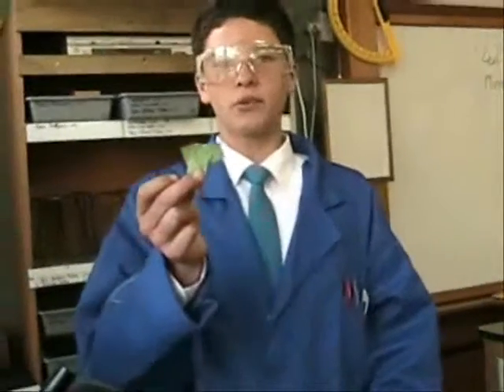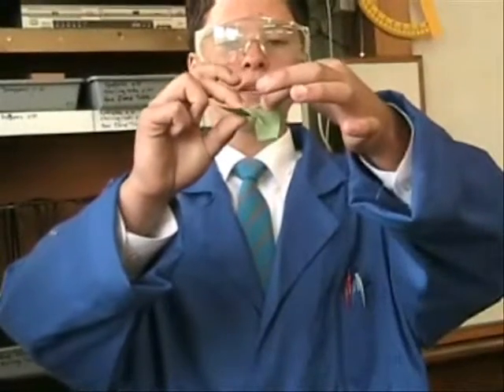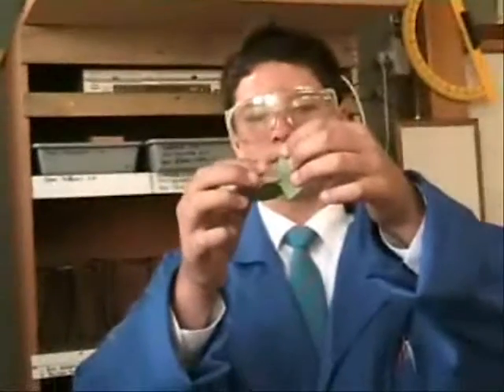First, you will take your piece of rhubarb leaf and tear it, the two pieces away from each other, leaving you with a clear piece of leaf.